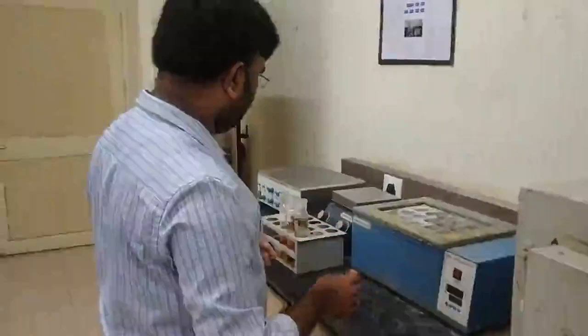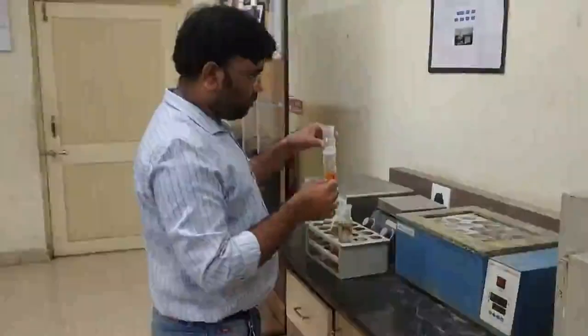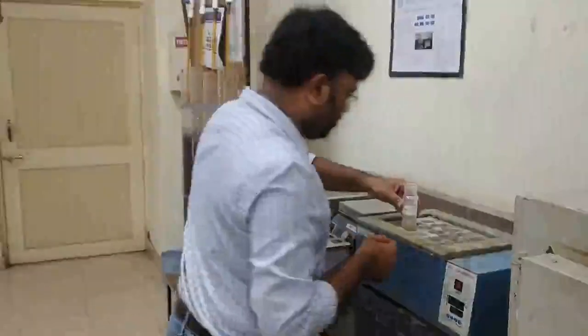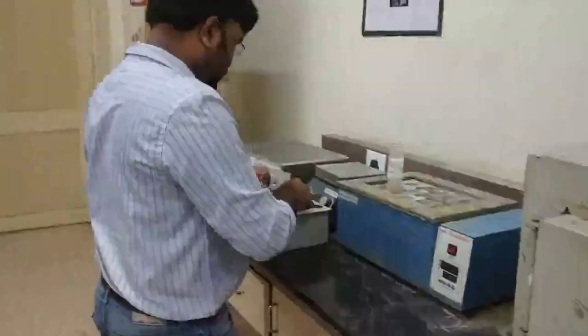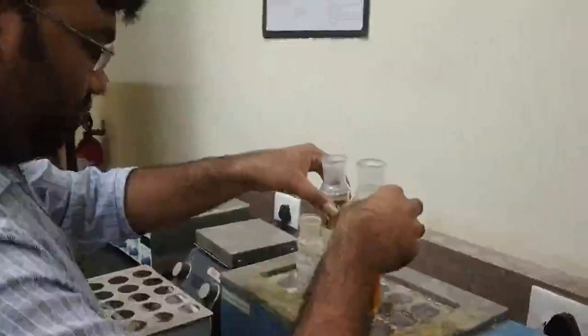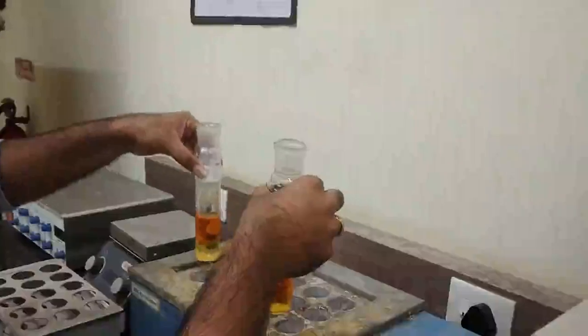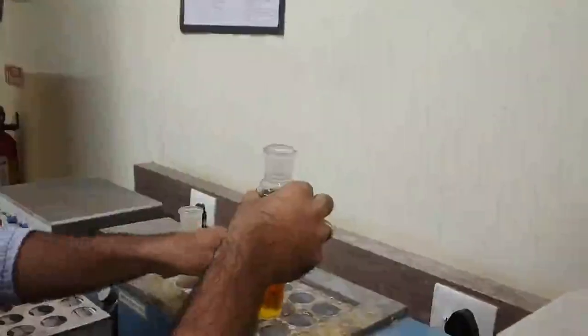Right, so this is the COD digester we have. We are going to keep the samples that we have with us in these. There is ample space, so we'll be keeping them alternately.